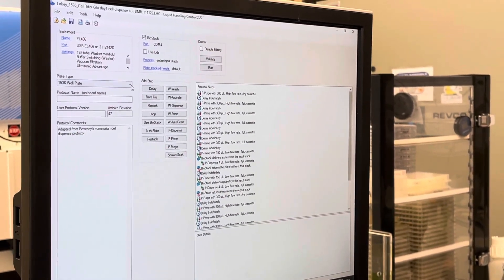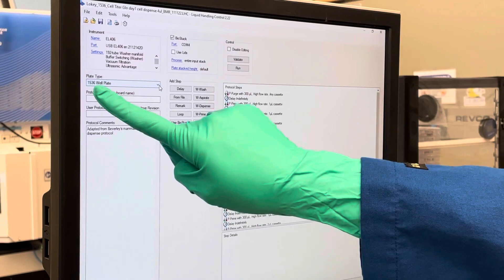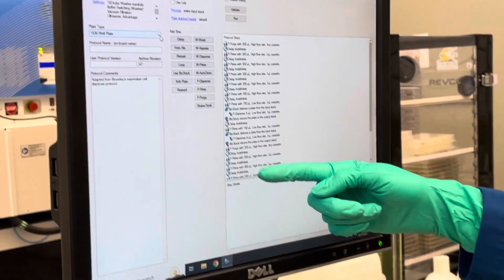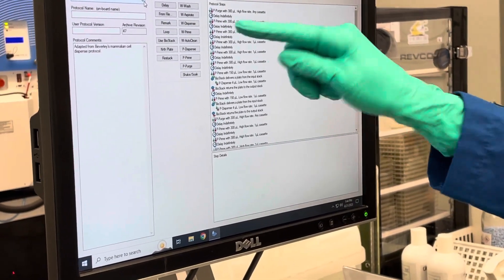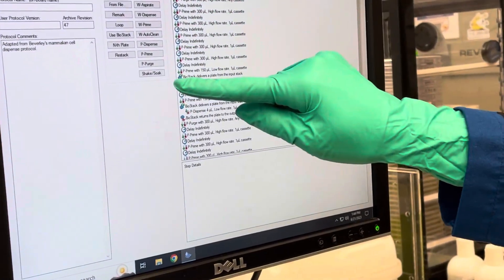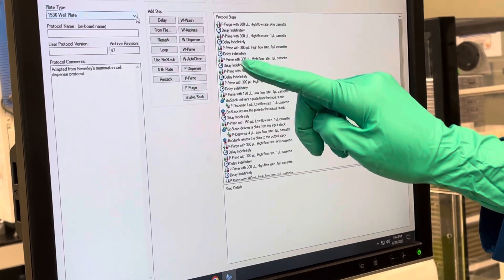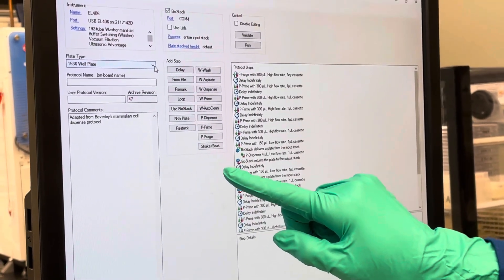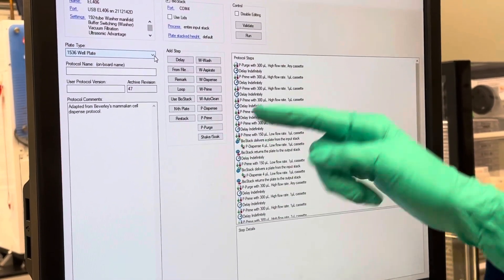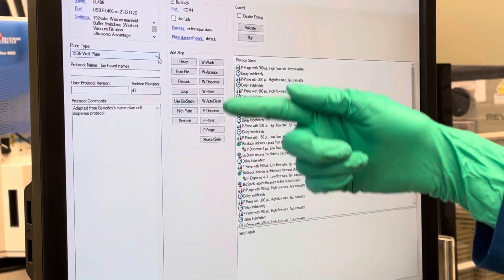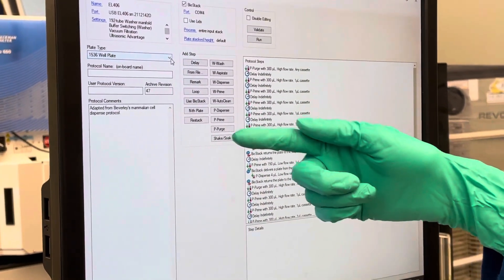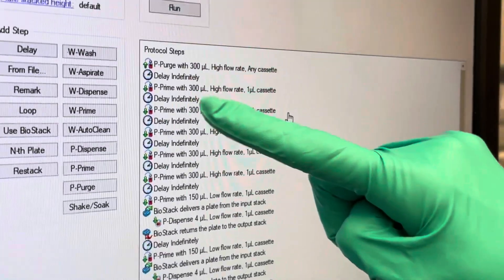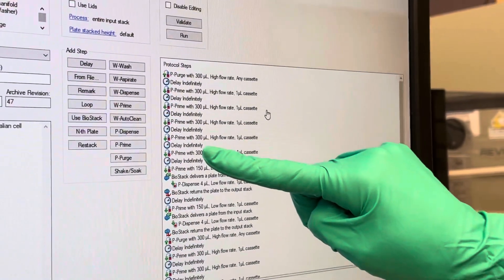When you open a protocol, it'll show the plate type over here — in this case it's a 1536 well plate — and the steps are outlined here. The steps for the wash module have a W, the steps for the syringe module have an S, and the ones for the peristaltic module, which is what we're going to use, have a P. Our steps have a purge and then a bunch of primes for washing the cassette.